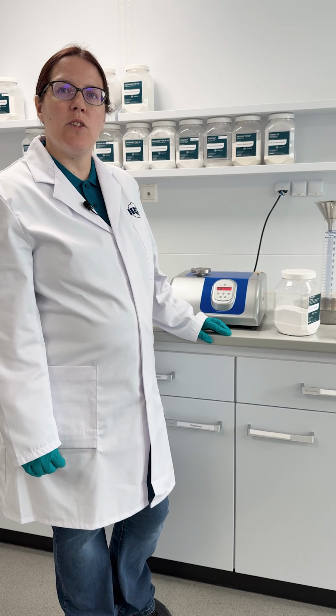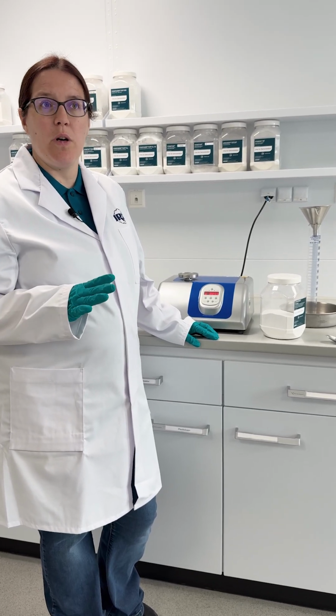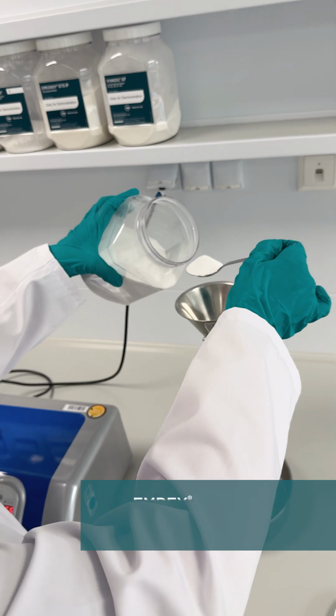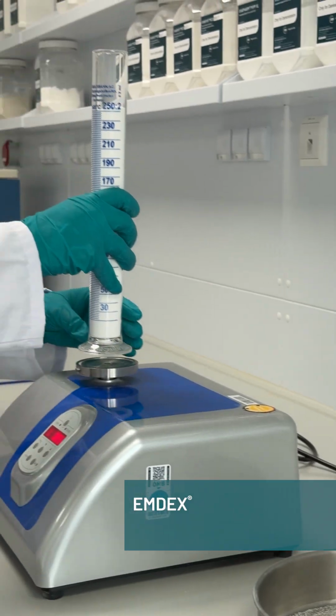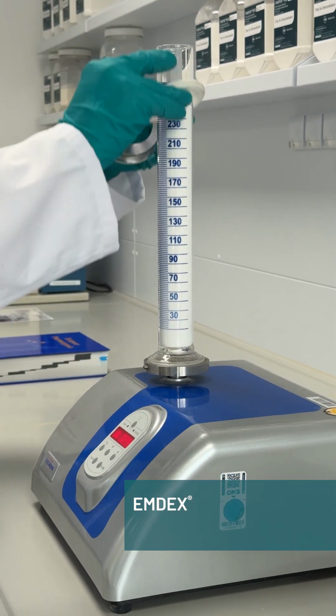And now we're going to take a look at tap density, and at the same time we're going to do a rough approximation of the Hausner ratio, looking at volume of bulk material over tap material. This is not precisely how it's done in the pharmacopoeia, but will give us a rough idea of the flowability of these materials. So I'm going to fill this 250 milliliter cylinder up to the top, so we have our initial bulk measurement. On average, it's roughly 250.